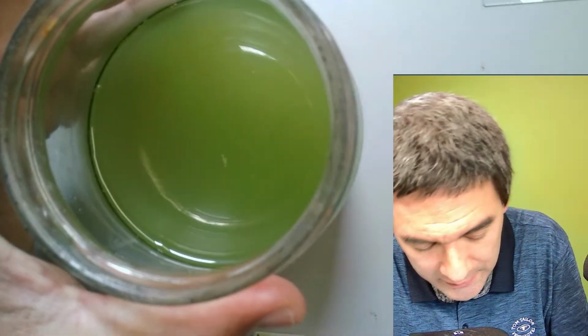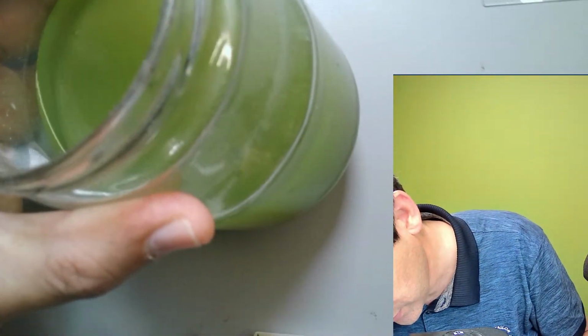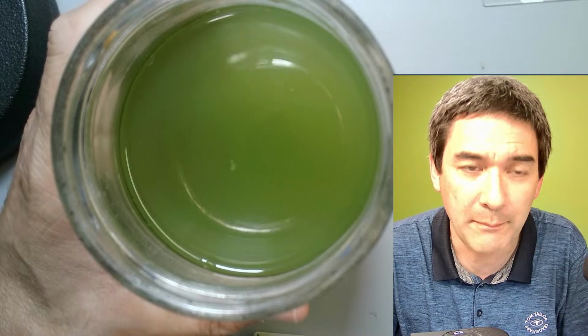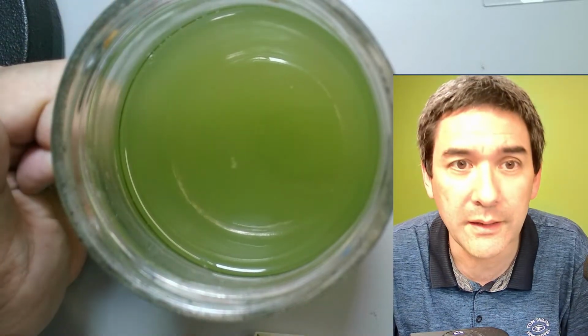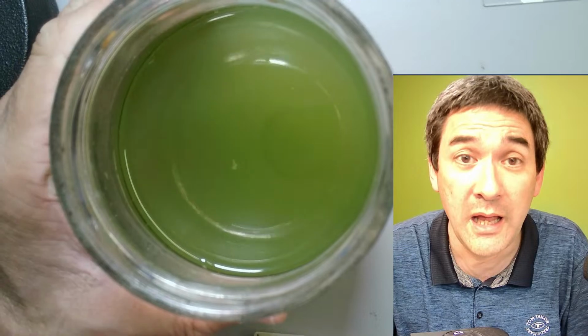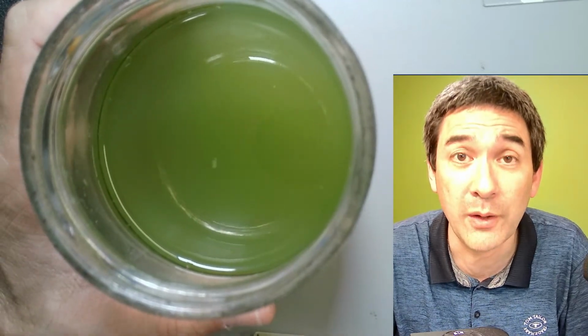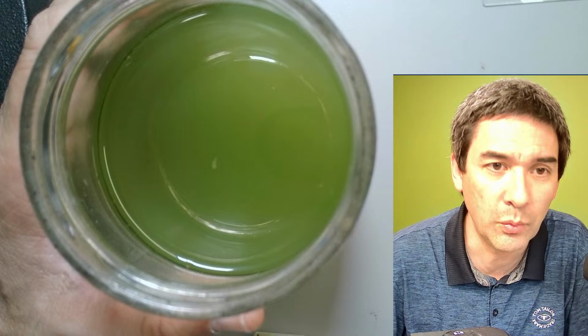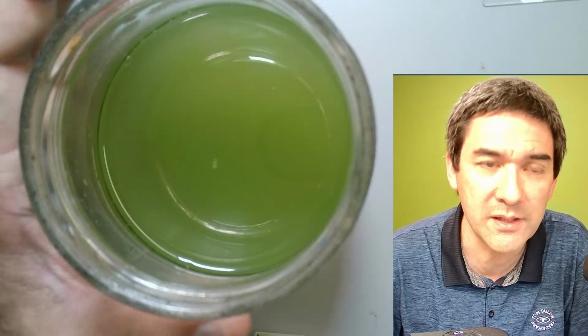Not so many right now. Yeah, for whatever reason, a few. But the whole sample turned green, meaning that algae started to grow. Why all of a sudden? Because I left it standing on my window and there was a lot of direct sunlight. Normally you want to keep it out of direct sunlight.